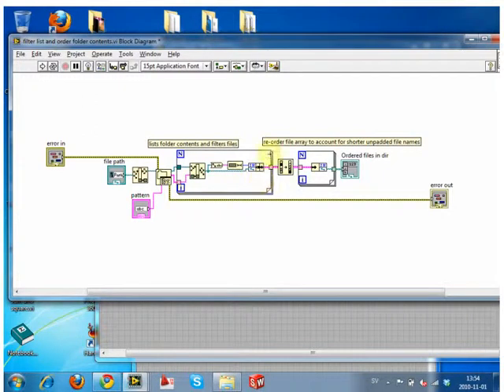They essentially come in, you can treat how they come in as an arbitrary sequence. It can be all over the place, there's no particular order. And how they come out is an arbitrary sequence. They're all over the place, there is no particular order. But because each file name, as it's read in, we are now giving it an extra bit of data, which is how long the file is. We are now not using this order that they were inputted and outputted in as our reference. We are now using this extra character that tells us how long the file name is.